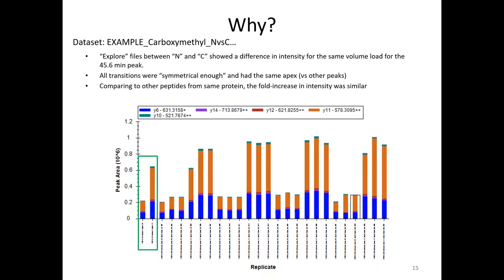So that peptide was targeted in 2 different samples, a normal and a cancer, and what we found, it was a peptide that had other peptides from the same protein that were monitored at the same time. If a protein is changing between two samples, the easiest thing to believe is that all of the peptides from that protein should have the same change.